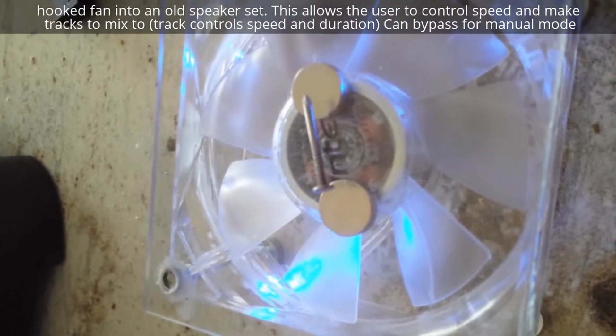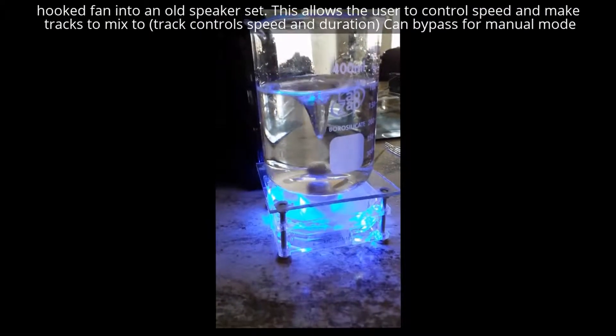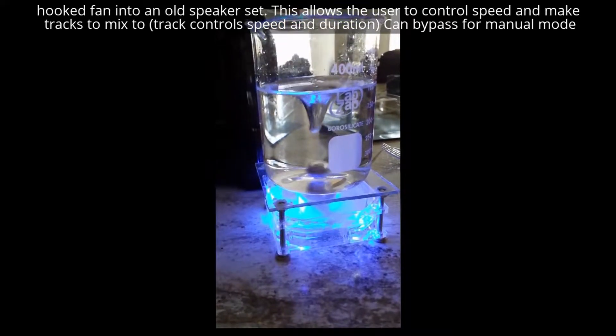Now let's see how it works with water. I can hold it steady at one height. I put the magnet in, dialed it in, and now it's spinning.